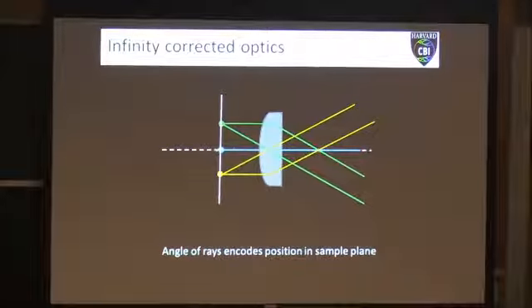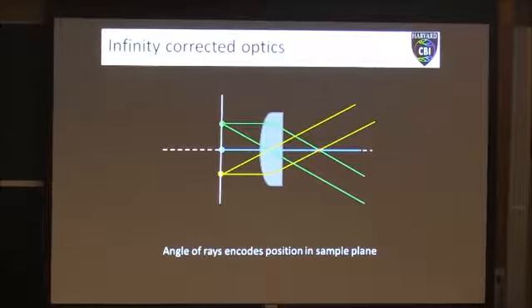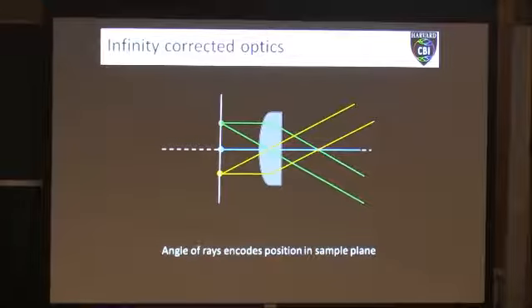And the light coming from the bead in the middle is just traveling straight through the objective. Whereas the light coming from this green one at the top goes through our objective and comes out at an angle in this direction. And the yellow one here comes out at an angle in this direction. And the other thing that you have to think about too is I'm just showing you 2D cut-throughs of this, but this is actually happening in 3 dimensions as well.